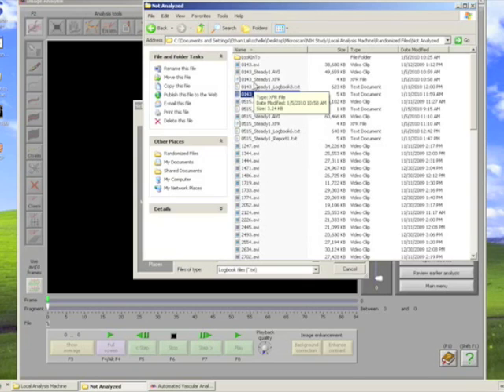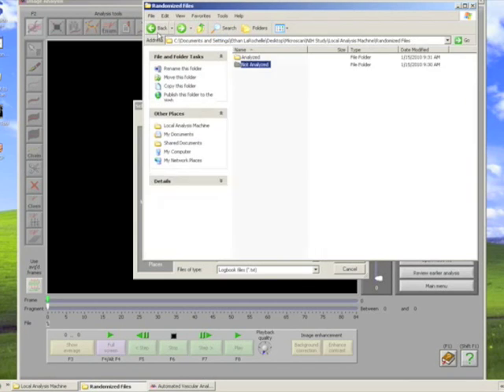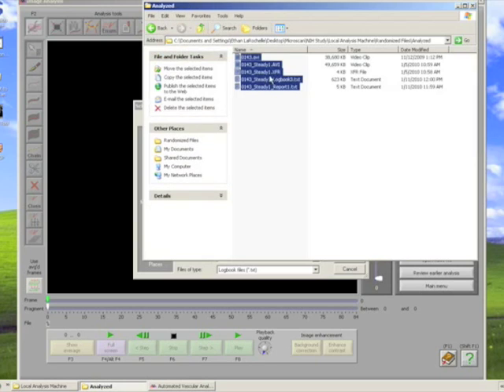After performing the analysis of a video, we move the original and stabilized videos along with the corresponding XFR file, the most recent logbook, and the report to a new folder. The reports can then be extracted into a database for further analysis.